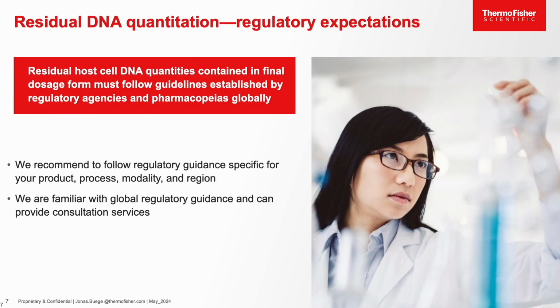But before we go further into the weeds, let's talk about a couple of things. First, the reason why you should be concerned with the amount of residual DNA left in your product is that we know that DNA can impact product quality, efficacy, and safety.